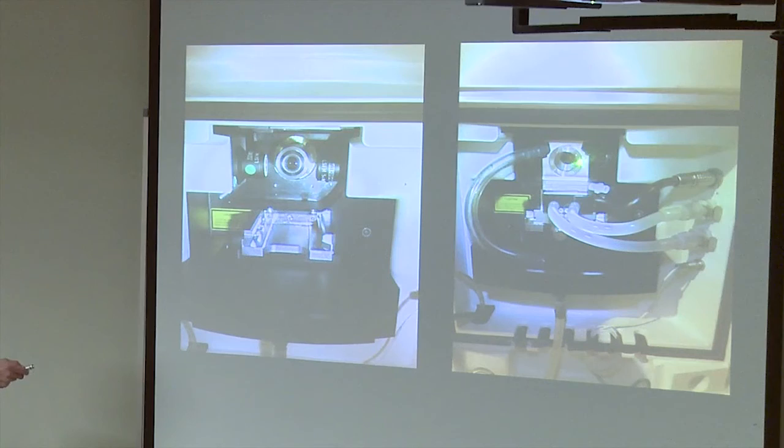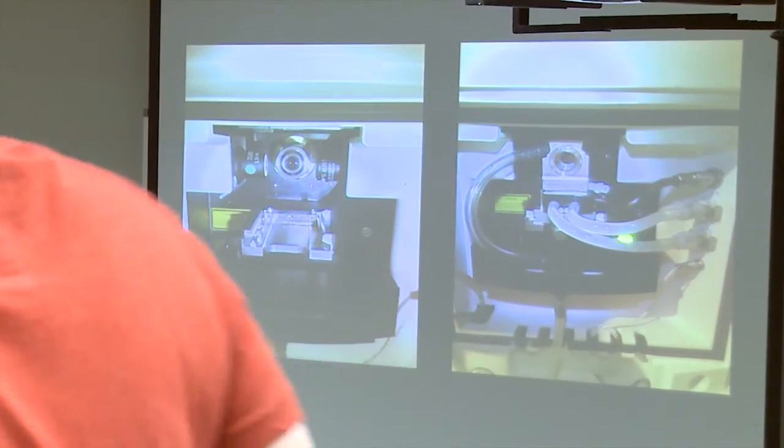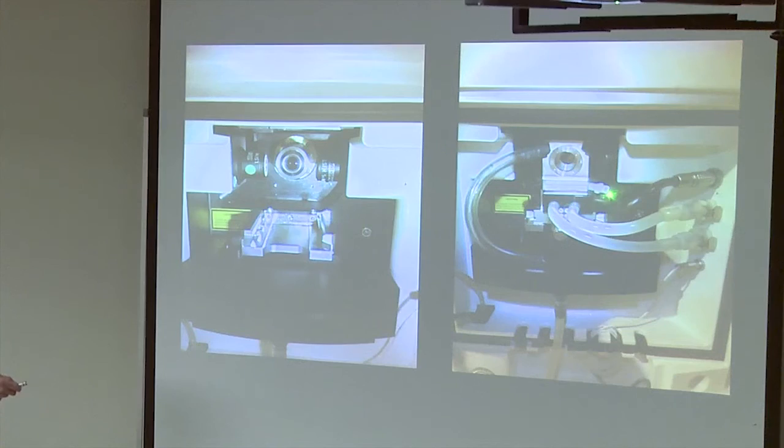What you can see is just a big piece of metal with 4 cover slips on each side. Our excitation light comes in through the sides, with the imaging objective at the back. Down here we have a little Peltier heater that can heat up this chamber if you're doing some live cell imaging. These 2 little lines here are water circulation to cool it down if it gets too warm, and this is a little power supply for that Peltier cooler. Over here we have a little inlet port. This is where we connect a syringe via an IV extension line, and we use that to fill the chamber with our imaging solution, which is usually just whatever buffer your sample is happy in, or the clearing solution that you've used to clear your sample.